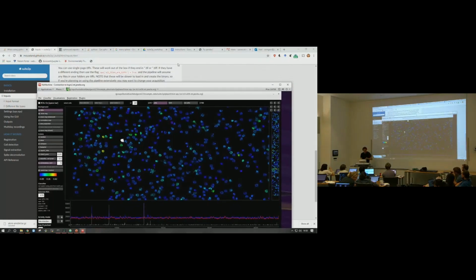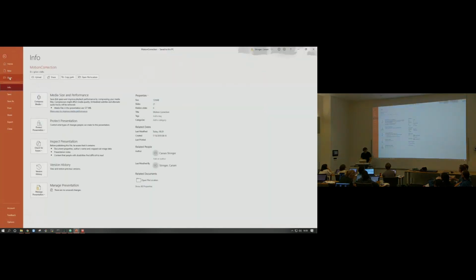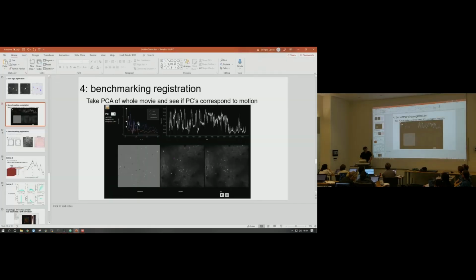And what we actually did in that paper, let's see, I don't know if Carsen has my slides here. No. Okay, well, it's a lot harder without ground truth to know if you're doing well, right? So one actual metric that we found useful was to ask what the signal to noise ratio of the cells was in response to stimuli.